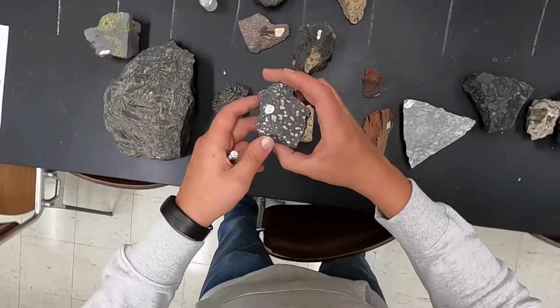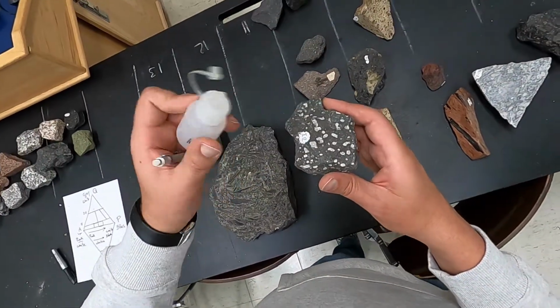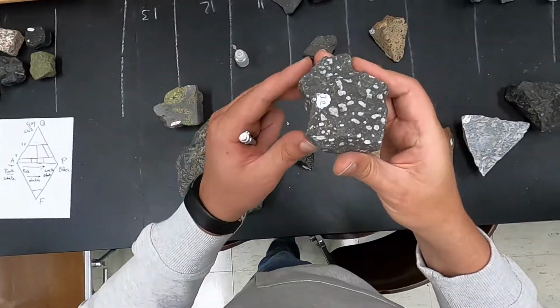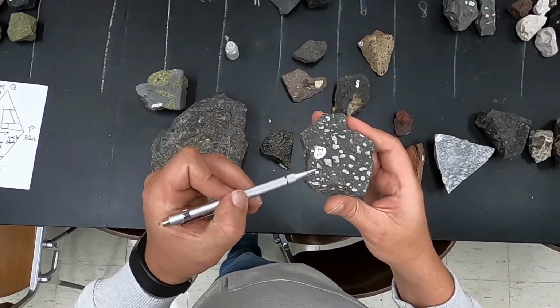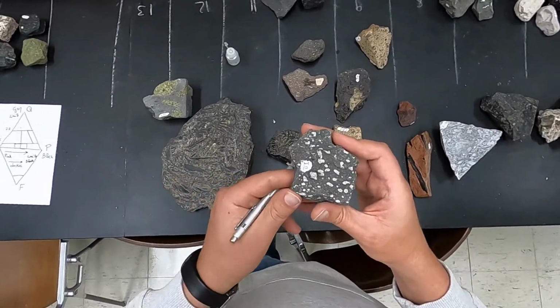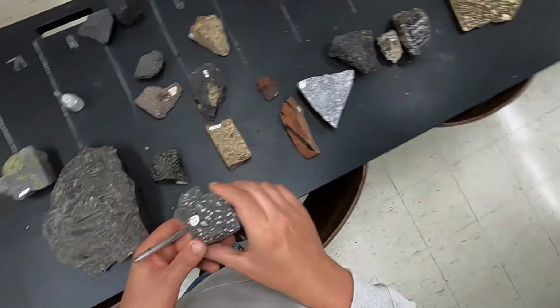Let's see if this one has carbonate, just to give you the full perspective, and you can see clearly it's fizzing. So we have identified the example of vesicles that are infilled with carbonate, so calcite in this particular case.